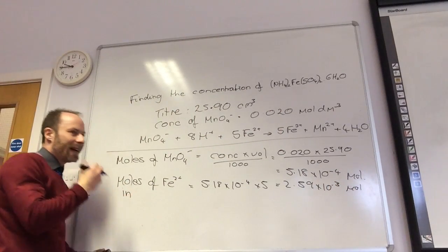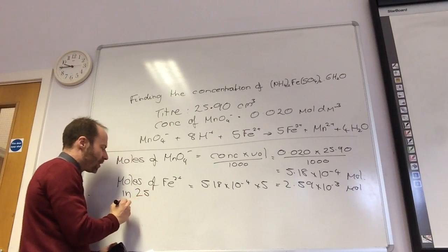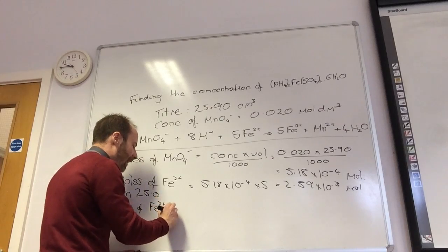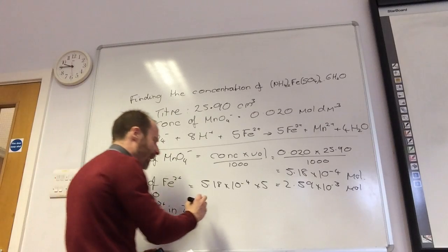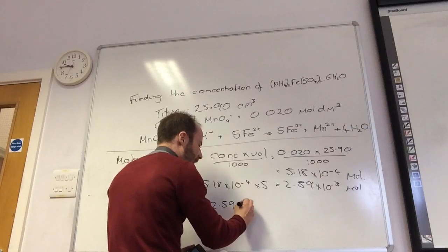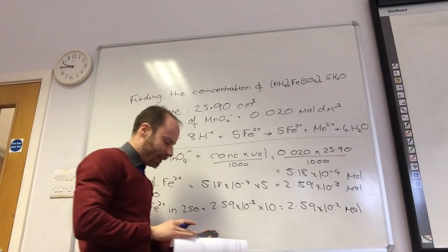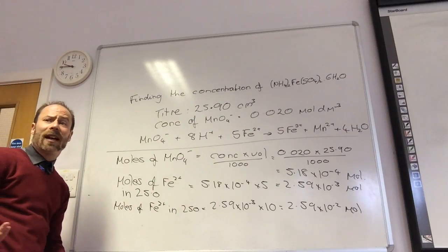What volume was that in? Well, that was in 25. So what about moles of Fe2+ in 250, which is my volumetric flask? Times by 10. So 2.59 times 10 to the minus 3 times 10 is 2.59 times 10 to the minus 2. Do you have to talk about the acid that we added in? No, that's just to get the reaction to work.